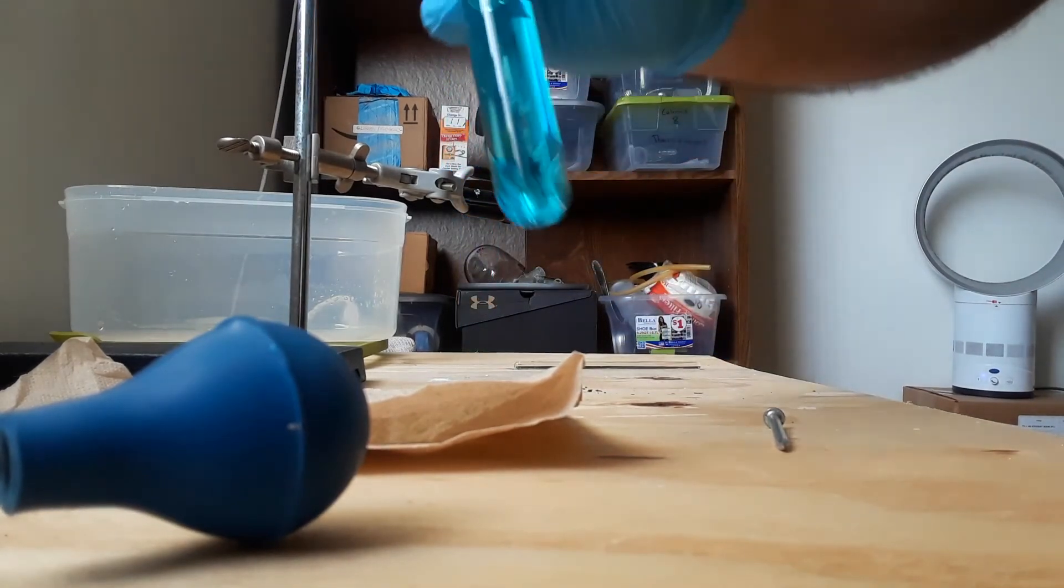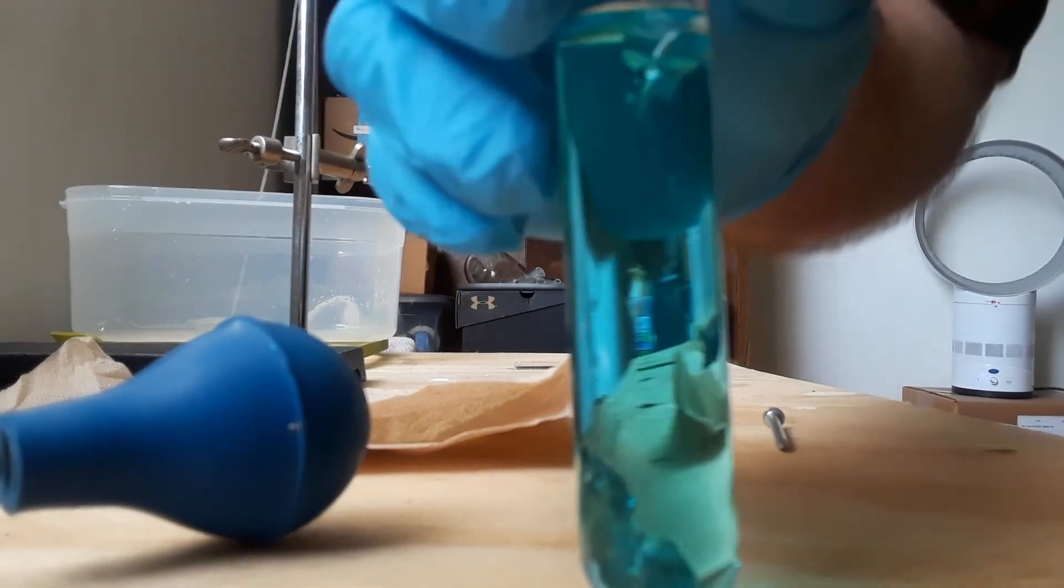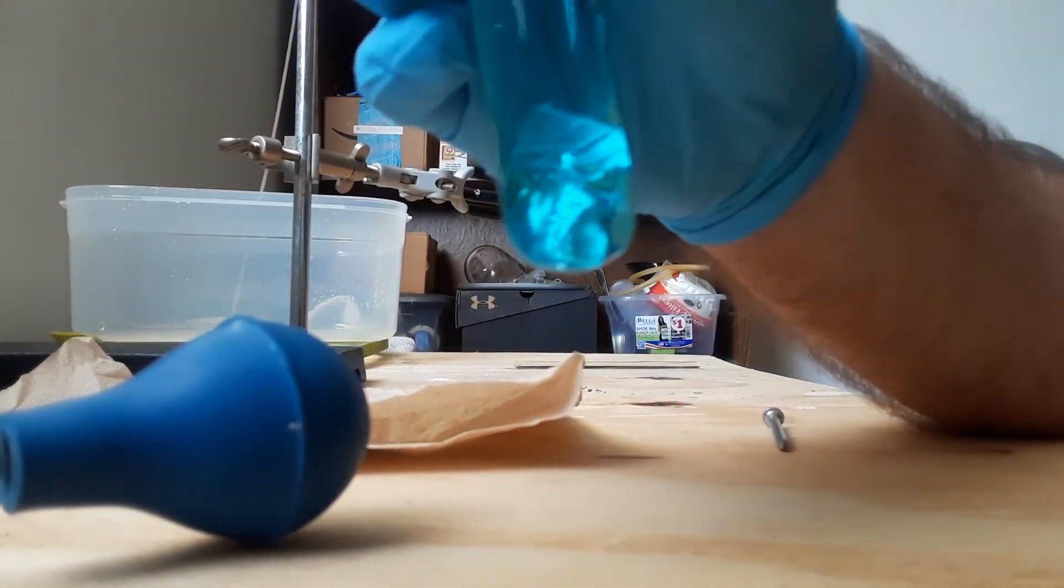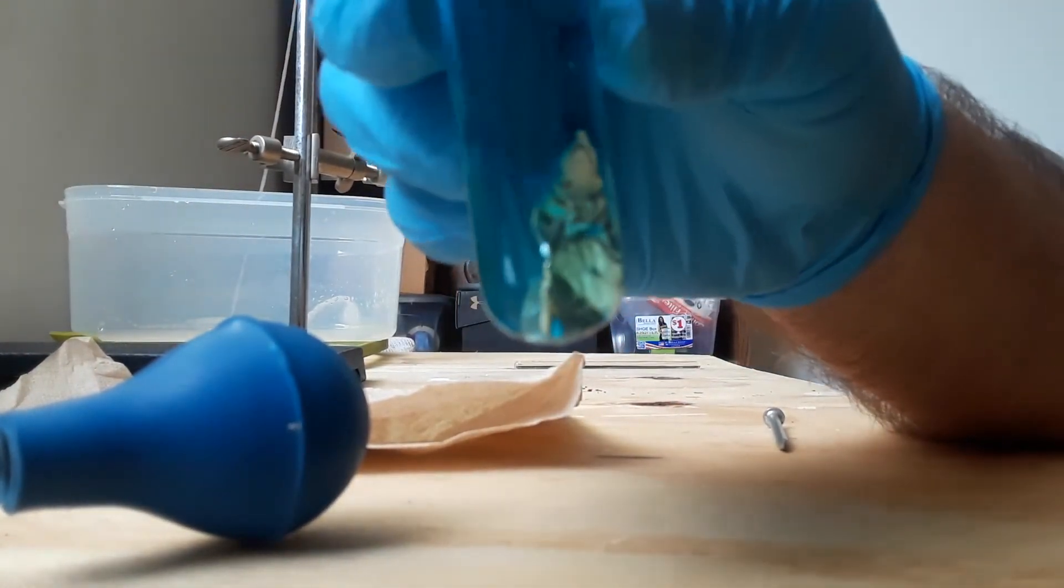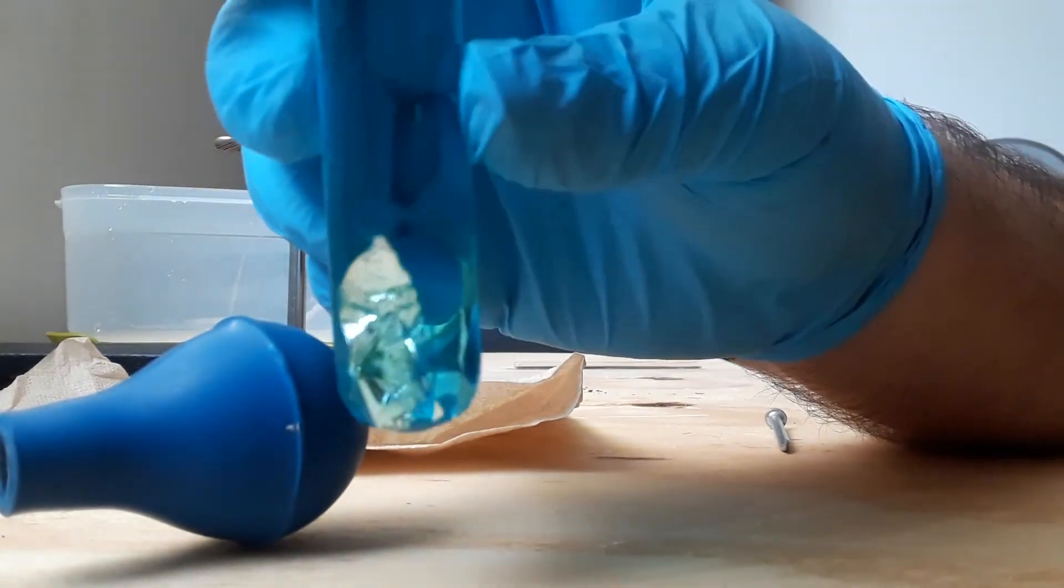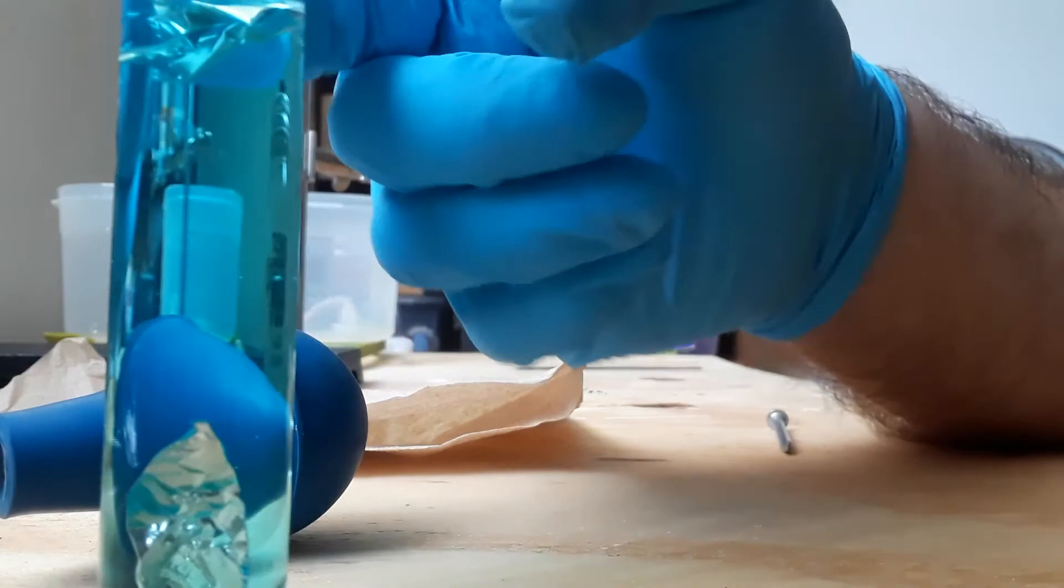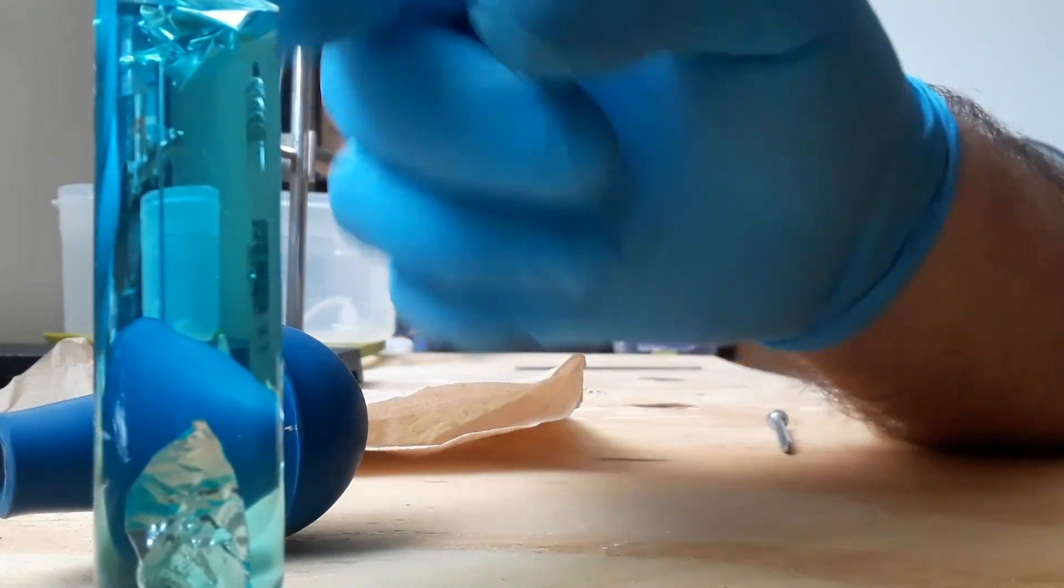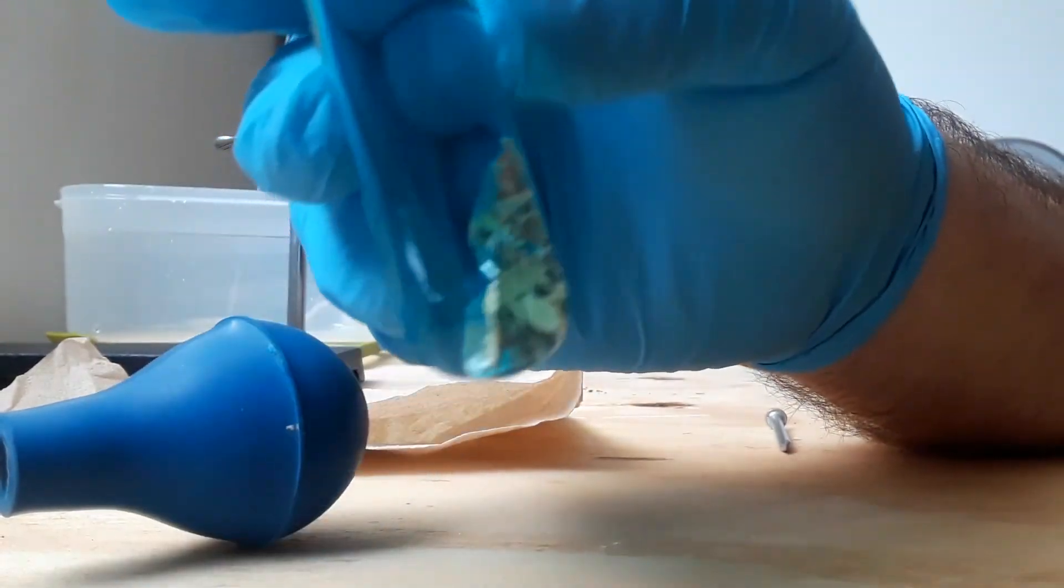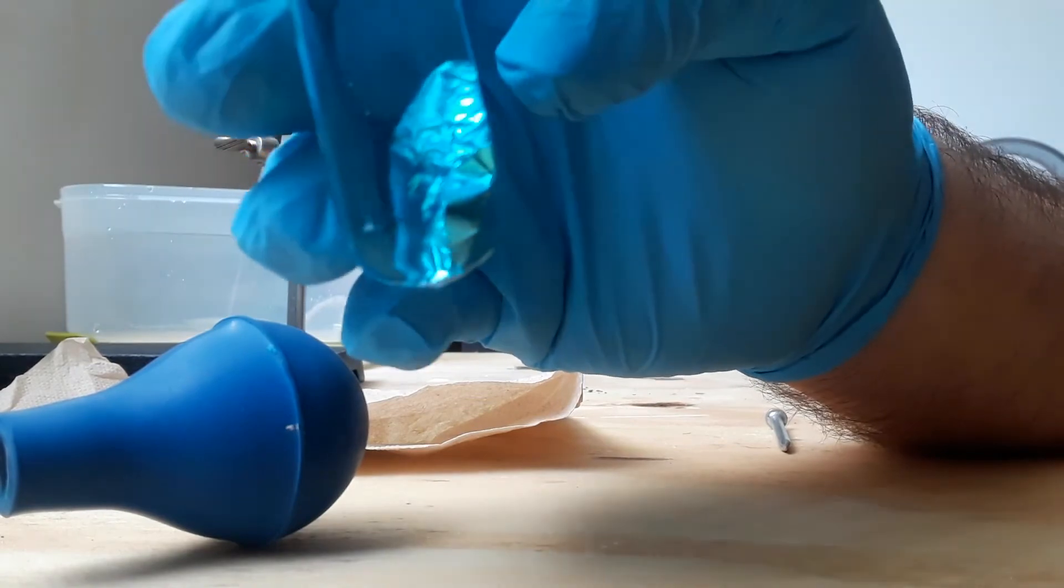That's interesting. The foil that I scratched sunk right to the bottom but the one that I didn't is floating on top, so there's a density difference. It could be I squished this one a little bit and there's an air pocket in there maybe, but I don't think so.